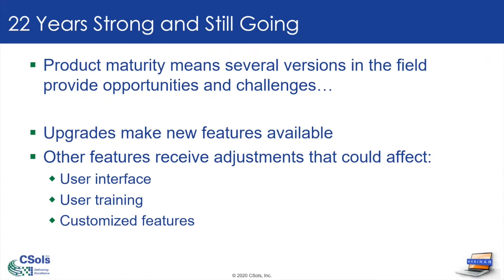Okay. So LabVantage is 22 years. So I wasn't going to talk about how long ago it was, but it's 22 years and it's still going. It's been redeveloped, it's been enhanced. It's a large and very mature product. It means there's several versions out there in the field. People might be on an older version, have taken the "it isn't broke, don't fix it" approach to upgrading, but now they're thinking of moving forwards, either because they need to upgrade infrastructure, you want new features, want any bug fixes, you want to add more into the product. There's so many reasons for wanting to upgrade.